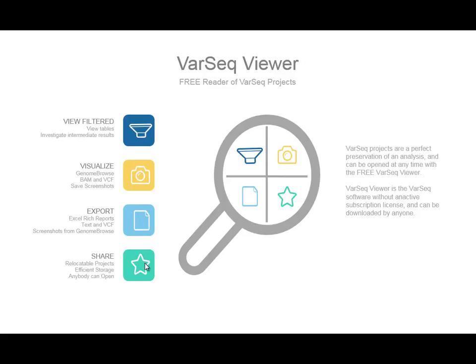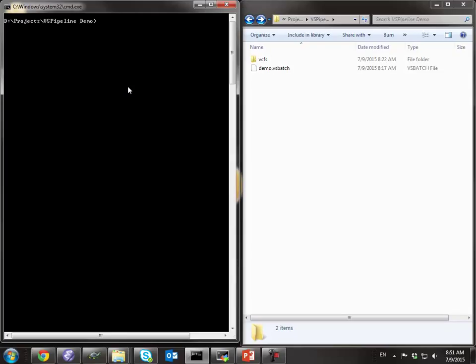Let's see how VarSeq Pipeline looks in a demo run. I'm going to run this demo on my Windows machine using a standard console, but you could also be running this — and often are — in a Linux environment as part of a series of steps executed by an automated secondary analysis pipeline. So right after the VCF files are created, you might run VS Pipeline to run these types of steps or more.